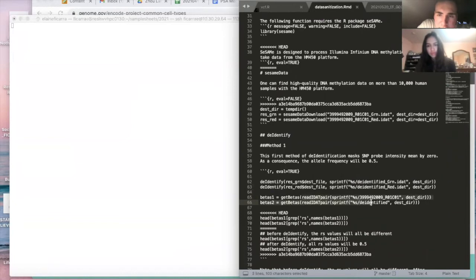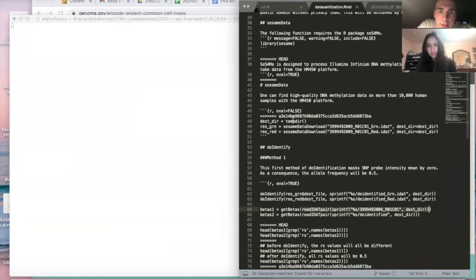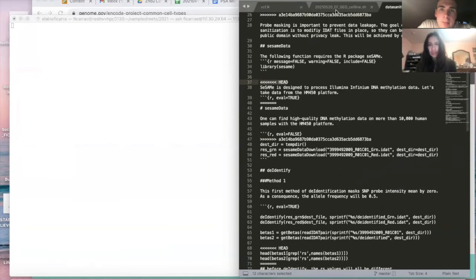That generates a SigSet. You should expect to use this. You should clean this up eventually because these arrows right here are from merges using GitHub. You see the HEAD right here? They're from merging with GitHub. So you can clean those up later.